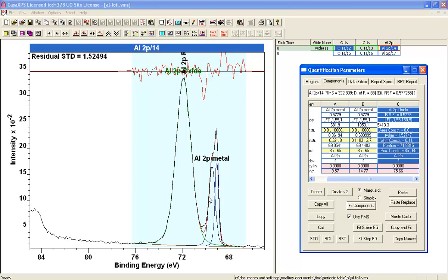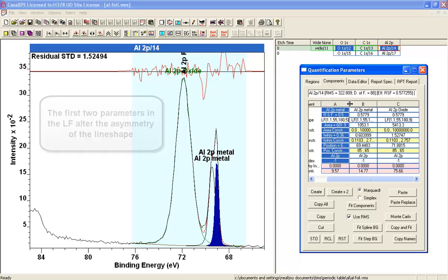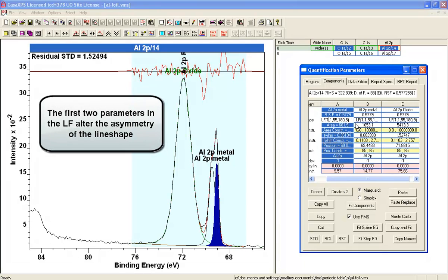But we've still got some structure here that we would like to accommodate by the metal, so now we need to introduce an asymmetric component to this peak.